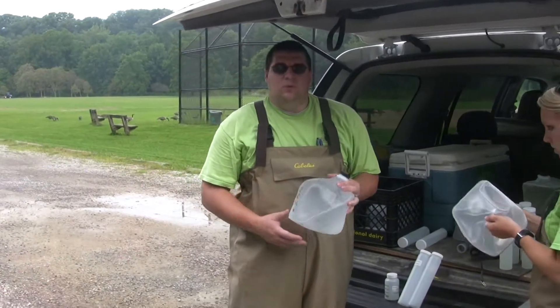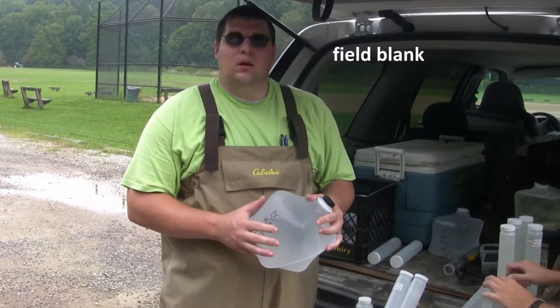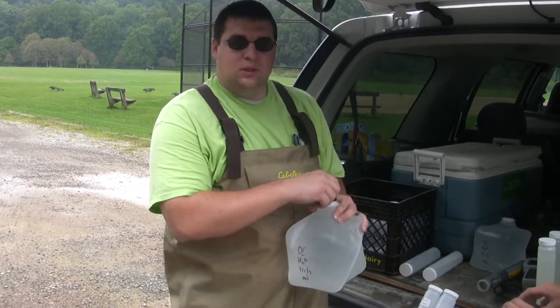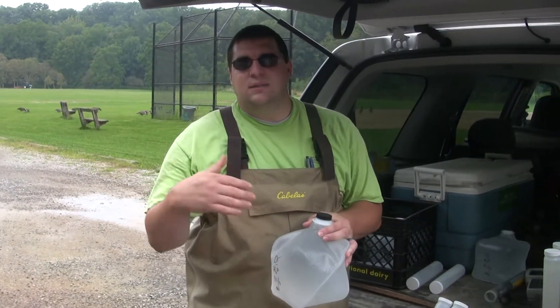Another sample we have to do is what's called a field blank. I'm going to take this DI water — deionized water — and transfer it to this bottle that Jill's holding here. Basically what this one is going to show us is whether there is any contamination during travel, from sitting in the cooler, going to each site, things like that.